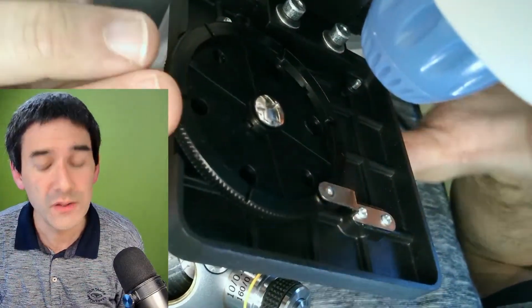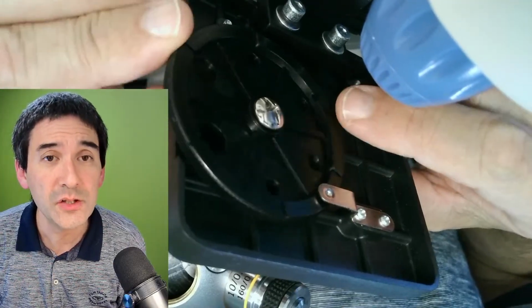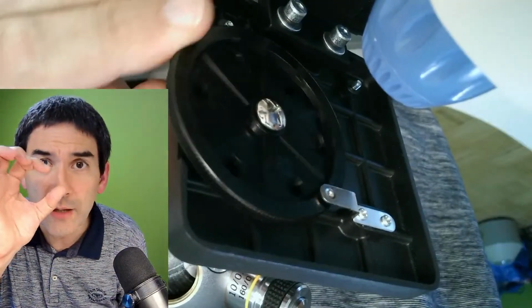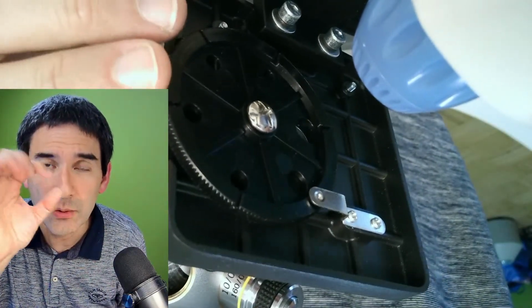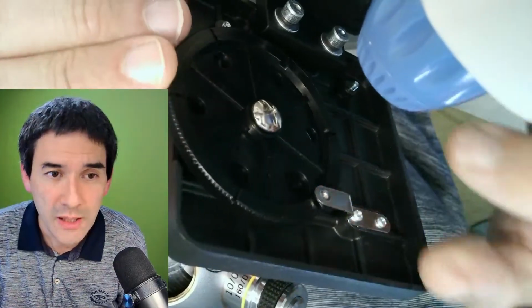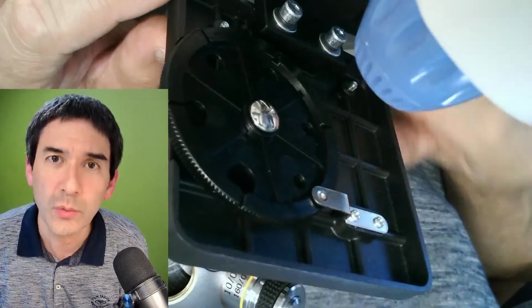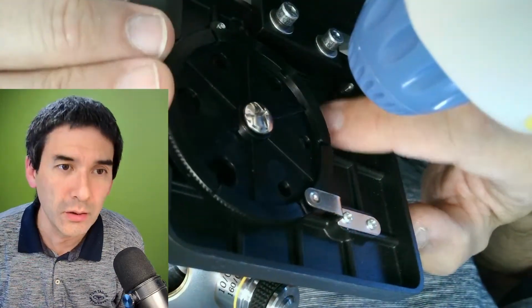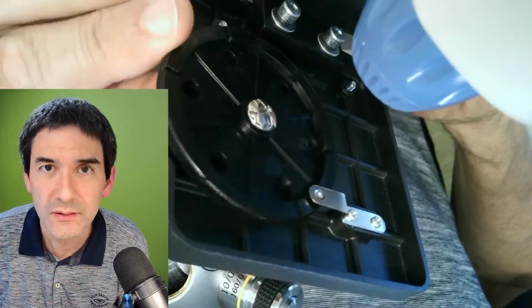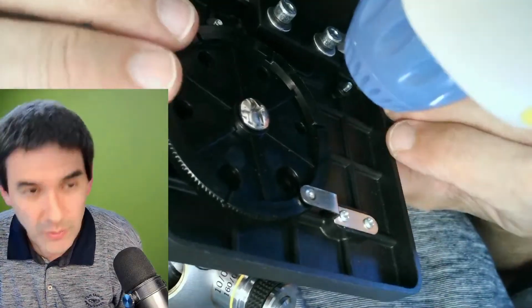You have holes in here of different diameter, and this is supposed to simulate or emulate the aperture diaphragm. Normally in a condenser, you have this lever that you can move back and forth to change the aperture, and this is basically supposed to emulate this. This would actually be a nice idea, but there's only one problem. It doesn't work because all of the diameters here are too big. It makes no difference. This is a little bit of a pity, and I don't get it.